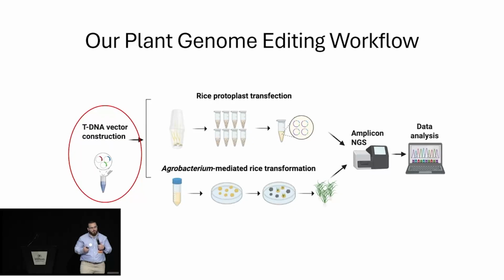And so we have an entire genome editing workflow involving rice protoplast transformation, as well as agrobacterium-mediated transformation in several plant species in our lab. However, I'm just going to focus on what's circled in red here, just the first component, which would be vector construction.